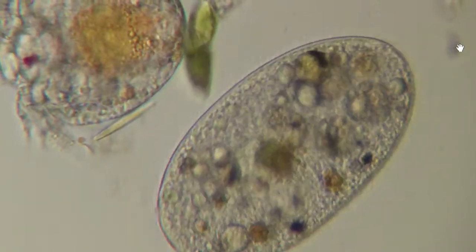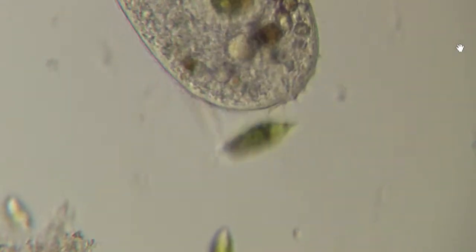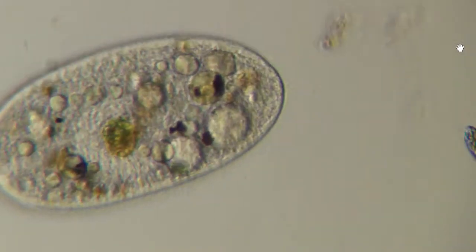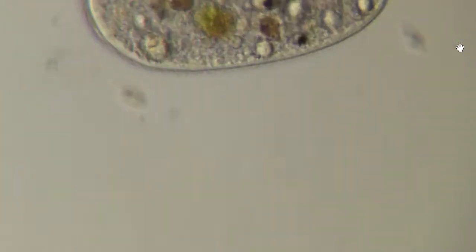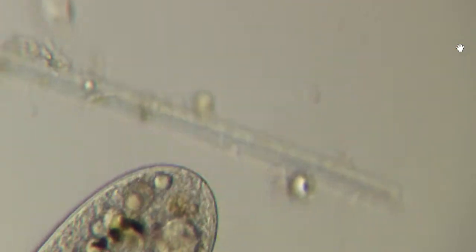So I forgot what species this is or even what family this is. But these are really nice because they eat a bunch of debris. You get really nice insight into the structure as the food vacuoles all have different colors and sizes. So endocytosis, they take in fluid or they take in prey, form a little vacuole around it, essentially like a micro stomach.